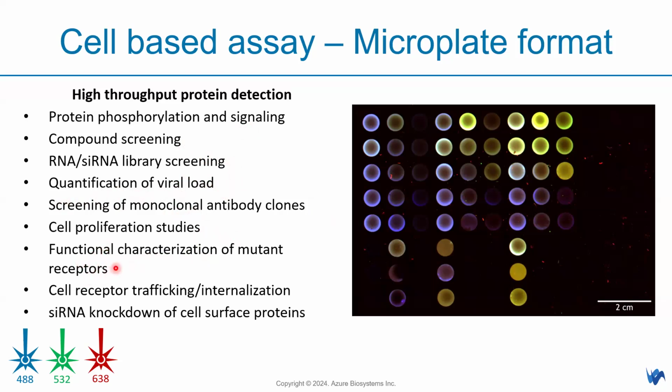This is more like the in-cell Western that we talk about, or looking at cell receptor trafficking or internalization. So we're looking at on-cell expression or in-cell expression, and also siRNA knockdown of cell surface protein. This is in microplate format, but you can utilize it in different manners, looking at on-cell or in-cell expression, or anything that is showing fluorescent signals.